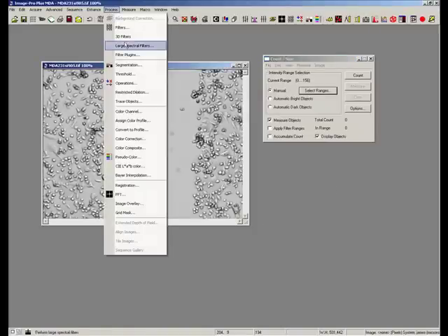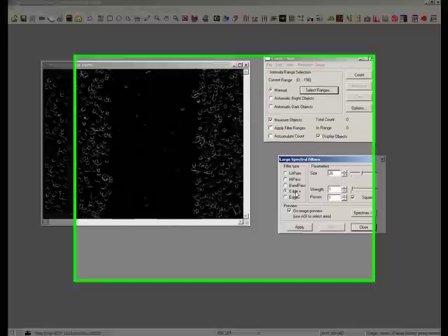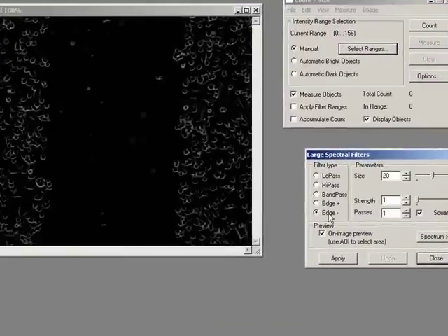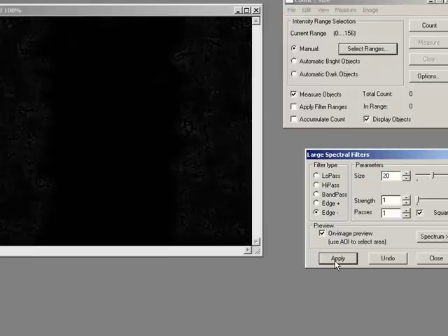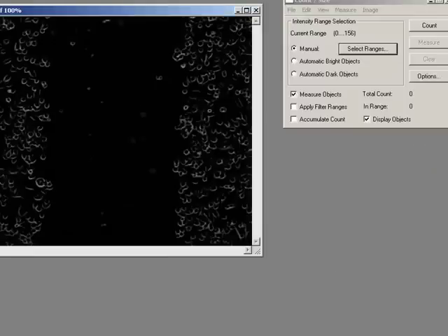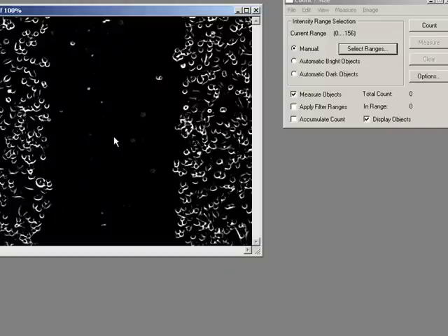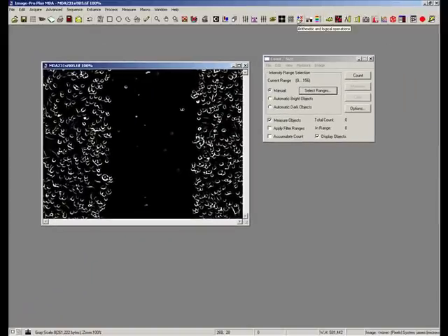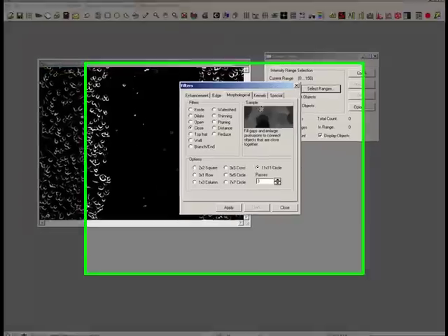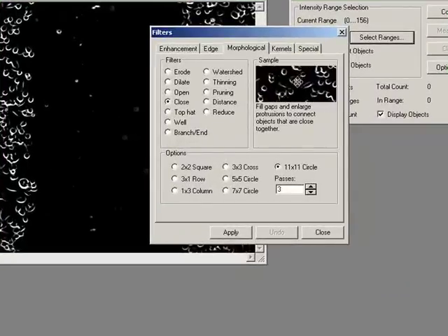What we're going to do here is apply something called a large spectral filter, which will effectively put an edge onto everything we're looking at — and that can be a positive or a negative edge. Just press apply. Now I'm going to connect all of these objects up together by using a close filter.